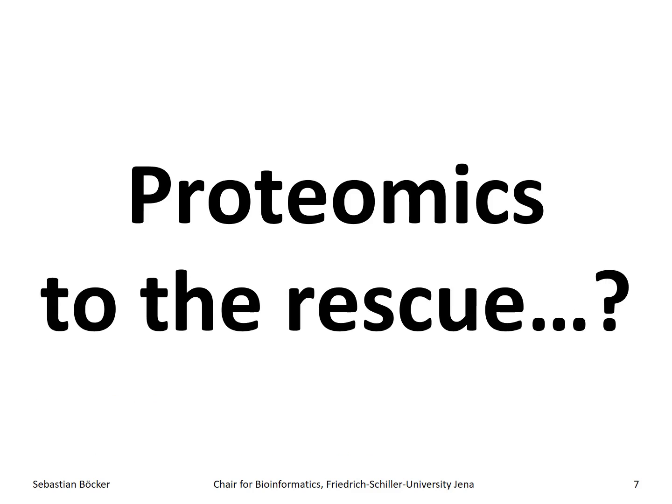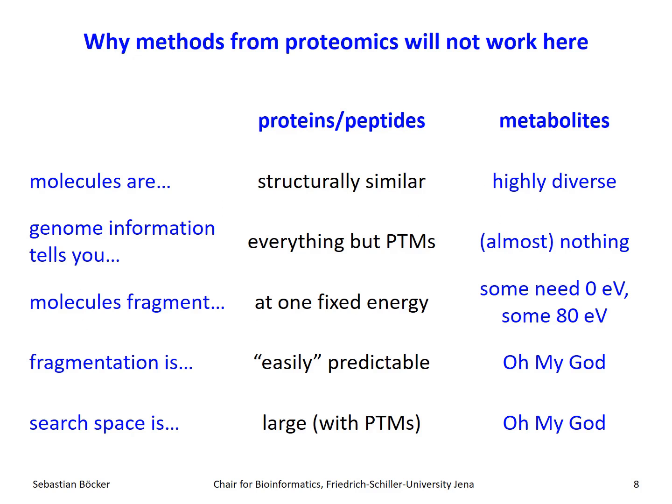And there are good reasons why this is not going to happen. And I have listed some of the differences between peptides and metabolites here. And there are many important things like this high structural similarity. We have macromolecules, peptides and proteins are at least on the level of mass spectrometry simply strings. But the other thing is similar to lipids. Fragmentation is relatively easy to predict, at least the ideal case, whereas for metabolites, even that is a super hard problem. And that's actually something I'm going to talk about in a few seconds. So I really don't see this is ever going to happen. Sorry about that.